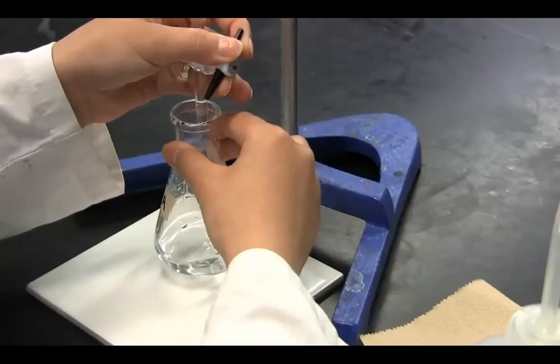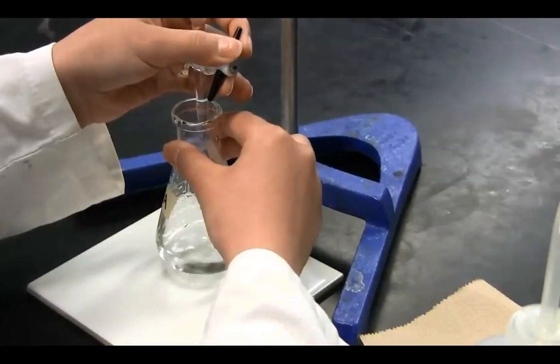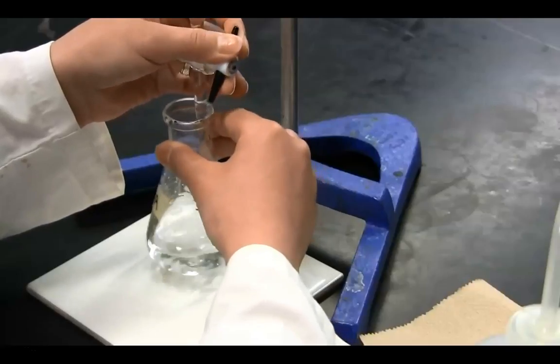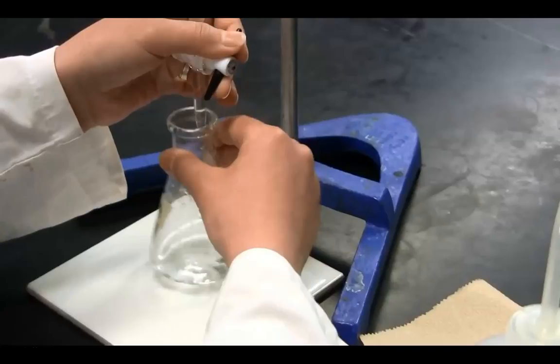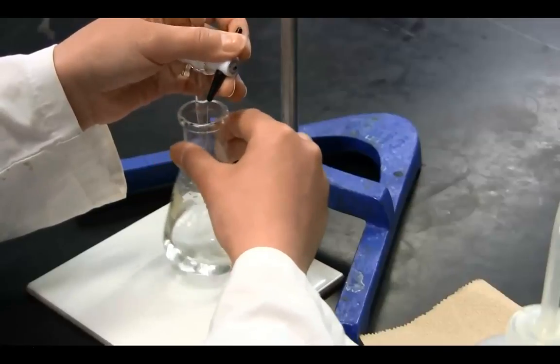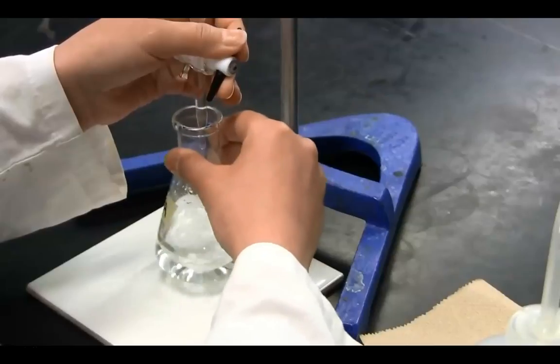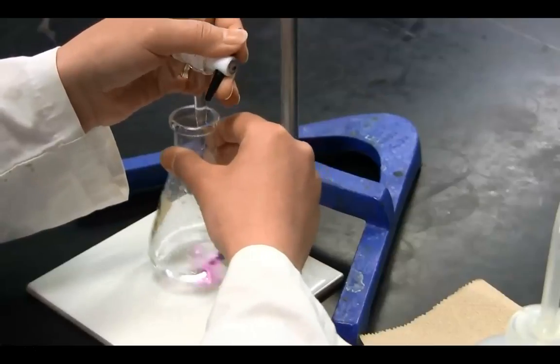Here's another example showing how to do it without gloves. Whether you use gloves or not will be decided by your instructor or teacher. The fingers are clearly seen around the tap, controlling it in the off and on positions. The right hand is holding the flask at the neck where a good swirling action can be made. This shows good titrating technique.